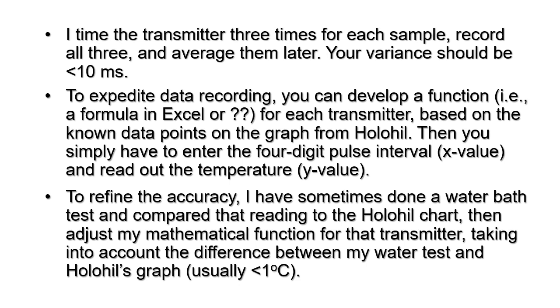To refine accuracy, I've sometimes done a water bath test and compared that reading to the Holohil chart and adjusted my mathematical function for that transmitter, taking into account the difference between my water test and Holohil's graph, which is usually less than 1 degree Celsius.